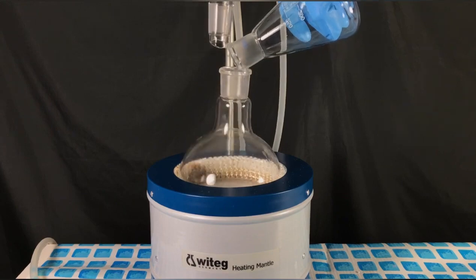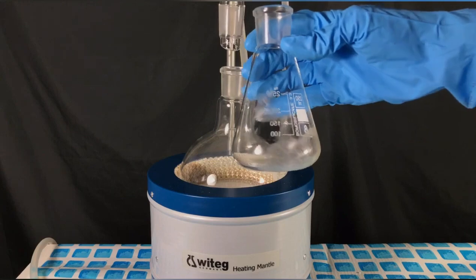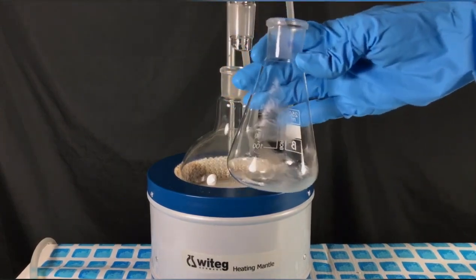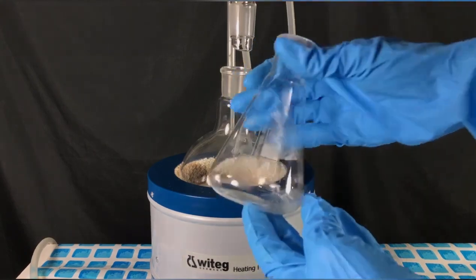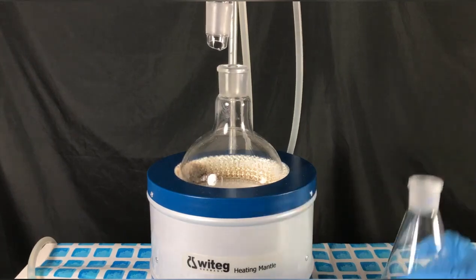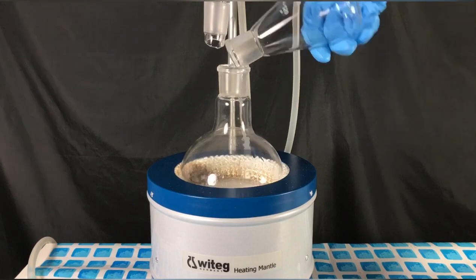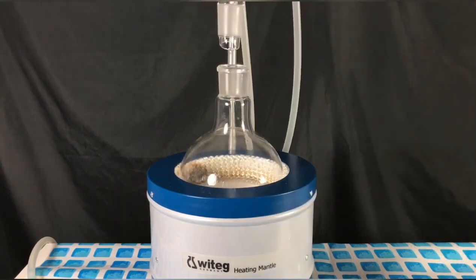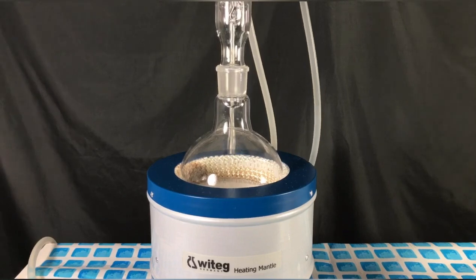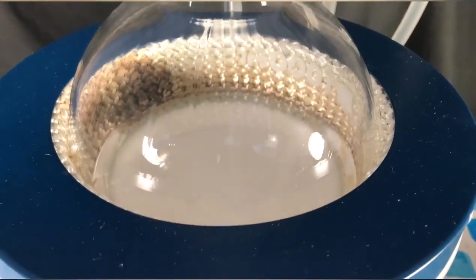Now look closely at the Erlenmeyer flask. What's interesting is that upon cooling, those nice urea crystals formed on the wall of the Erlenmeyer. The flask was swirled with a small amount of ethanol, which was later on also added to the reaction flask. This allowed us to transfer the urea that had crystallized on the walls into the reaction flask. The reflux condenser was then lowered down. This is what the mixture looked like.